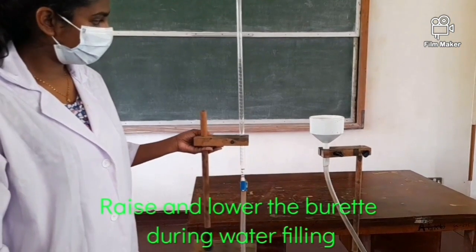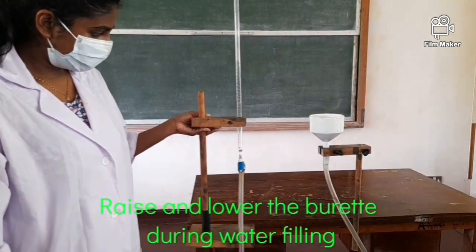Here, raise and lower the burette during the period of filling water.